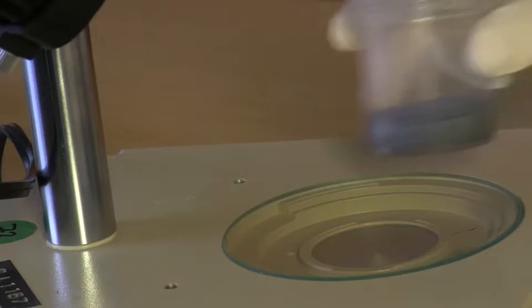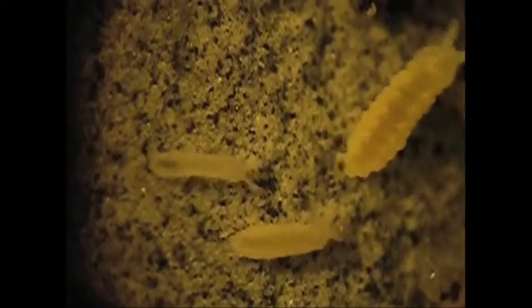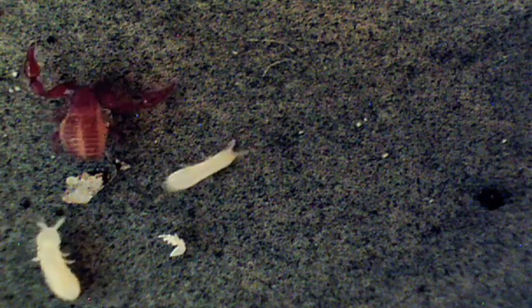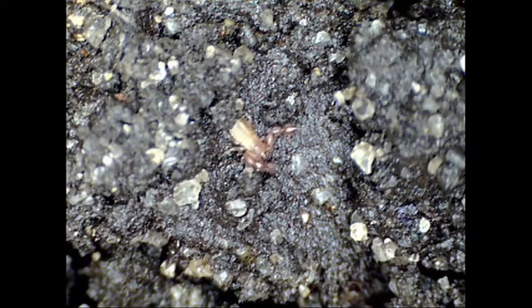Let's take a look at an earlier extraction. If you want lots of different animals in your sample, then it's best to set up an extraction using compost or a bait bag. Here's the sort of thing you might find. In this sample we've got springtails, mites and pseudoscorpions. It's always fun to see animals in their natural environment, so you could try looking at compost under the microscope.